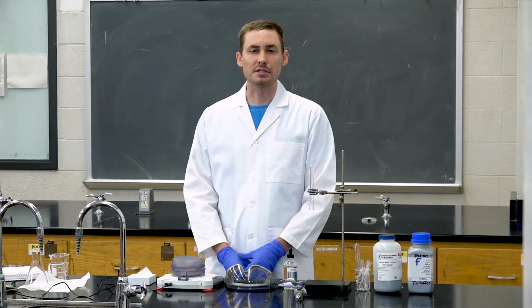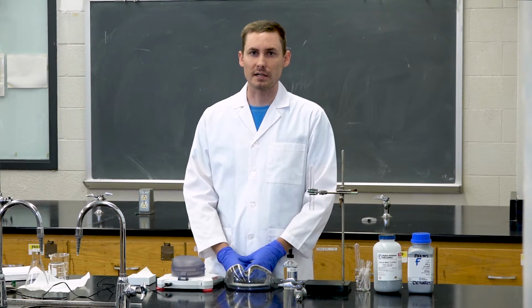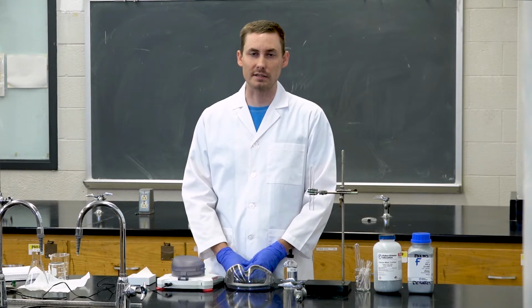More active metals such as sodium metal will have very violent reactions with water, even at room temperature. But metals in the group 2 column of the periodic table will have milder reactions, but will still react readily with water, such as calcium, barium, or strontium. So first we're going to be showing these reactions of calcium with hydrochloric acid and zinc as well.